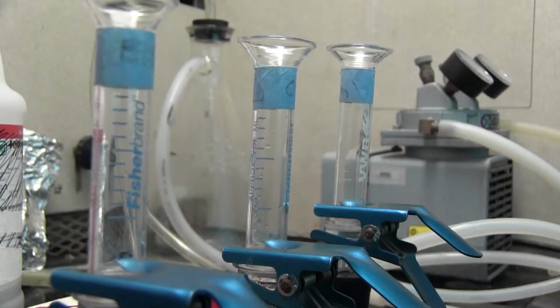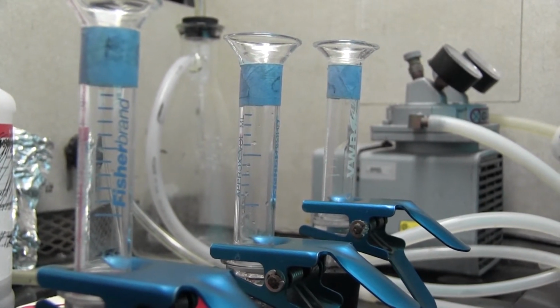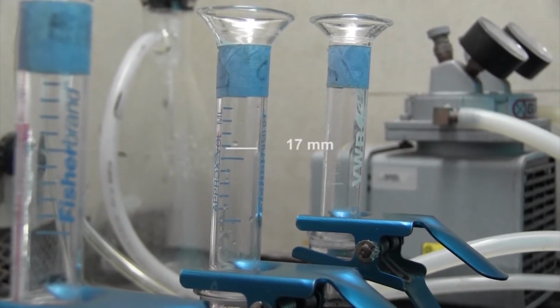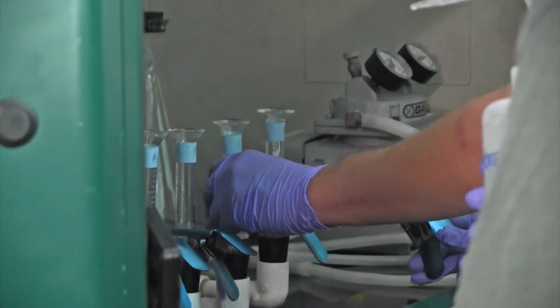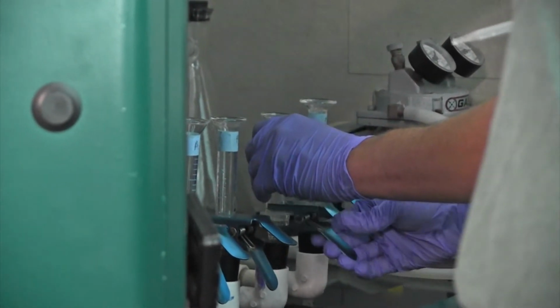Then when you start, we have towers with a specific diameter. So there's 25 millimeter towers that we buy, but the inside of the tower is smaller. So it's usually around 17, 18 millimeters. So we have to predetermine that, so we measure that ahead of time. And we have bases, which are just glass bases, and these are clipped together with a clip.